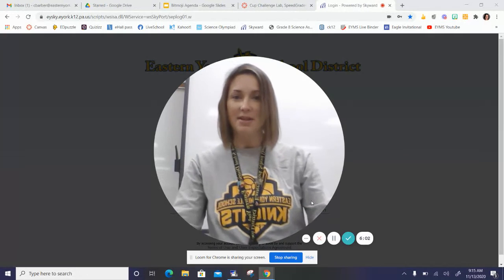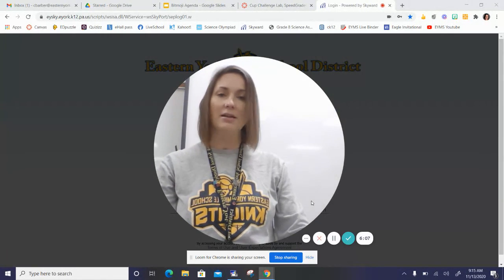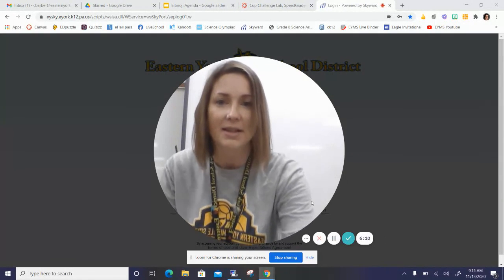Alrighty, I hope this helps. And again, you're going to explain which one provides the most accurate measurement and explain why. Thanks. I'll talk to you later.